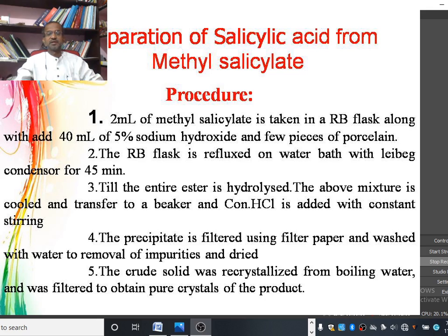The reflux continues till the entire ester, that is methyl salicylate, is hydrolyzed. The above mixture is then cooled and transferred to a beaker. Concentrated hydrochloric acid is added with constant stirring, and a white precipitate is formed.